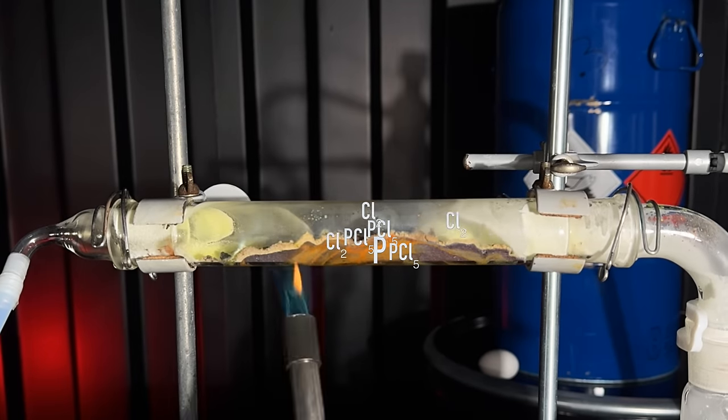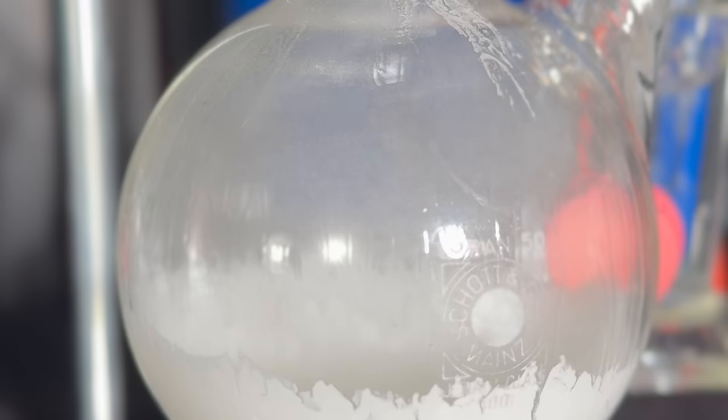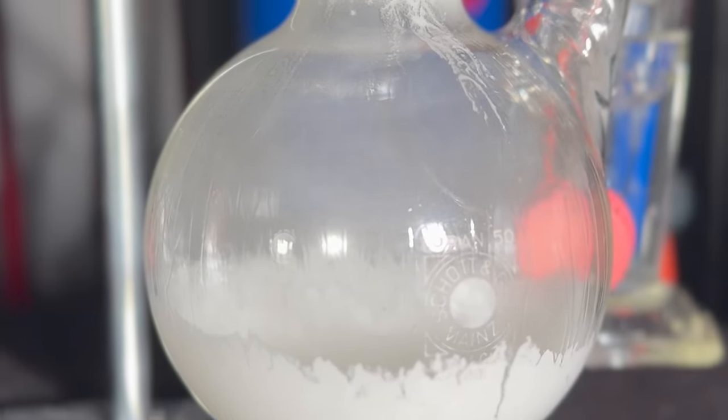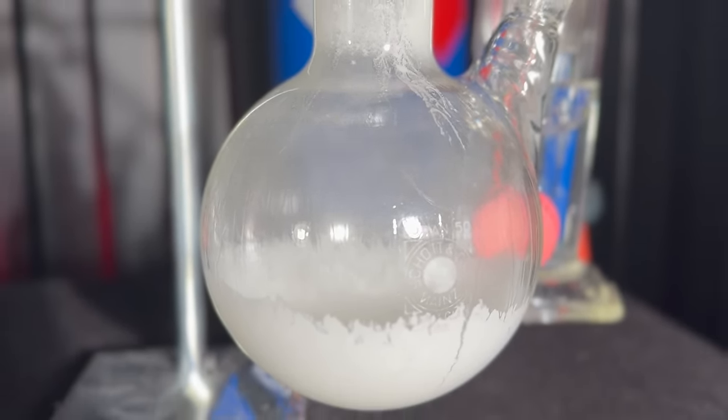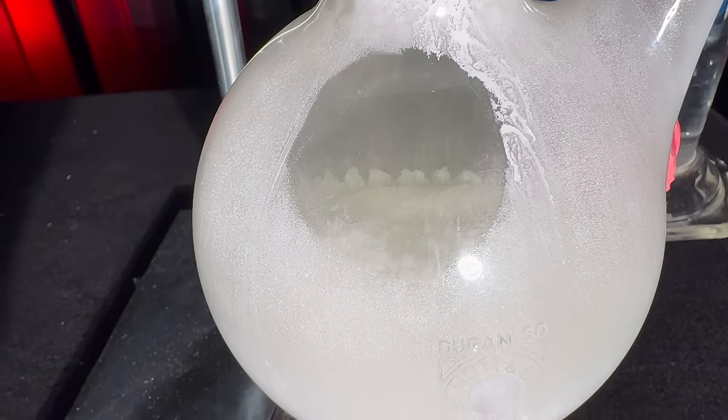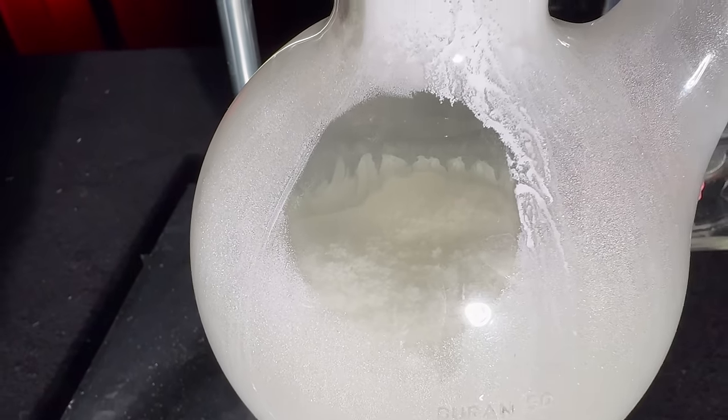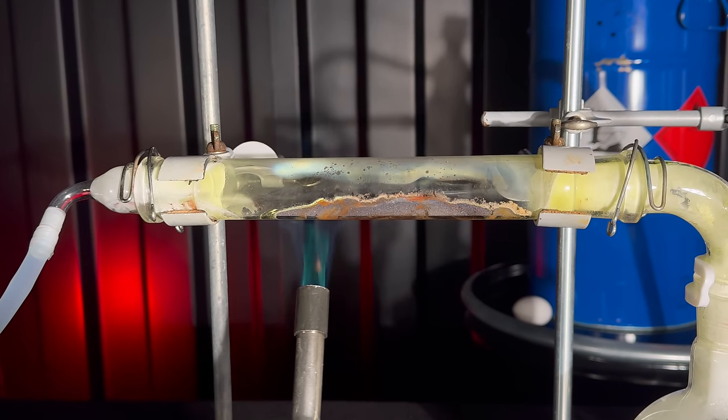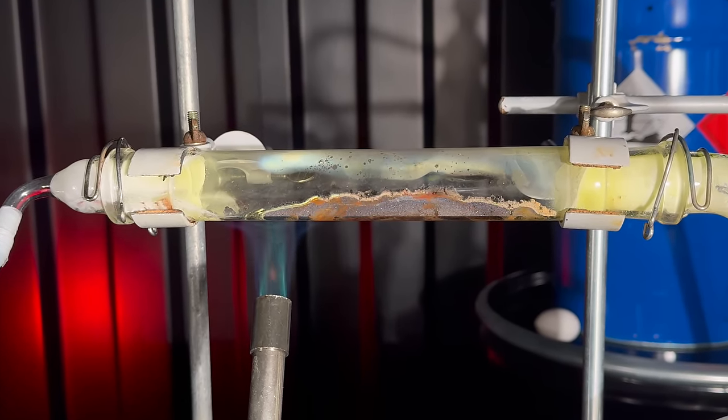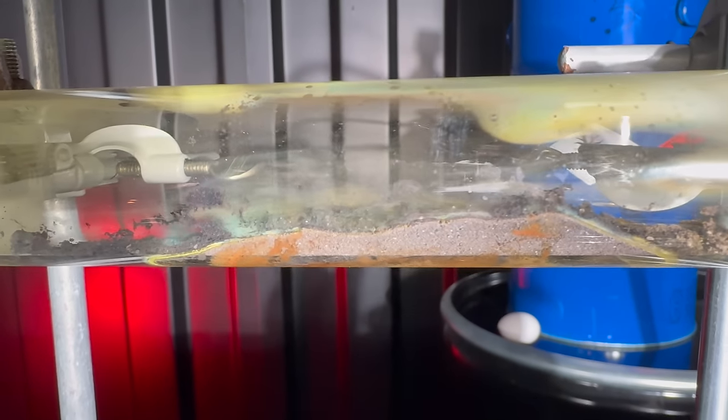The reaction needs to be heated continuously. PCl5 covers the surface of the phosphorus and if I don't sublime it off, the reaction will not continue. The resulting product is a white powder with a hint of yellow. I ended up having to heat the tube for more than half an hour, which was longer than expected.